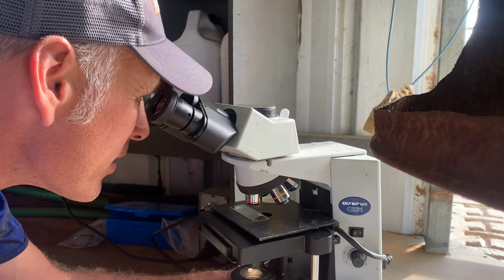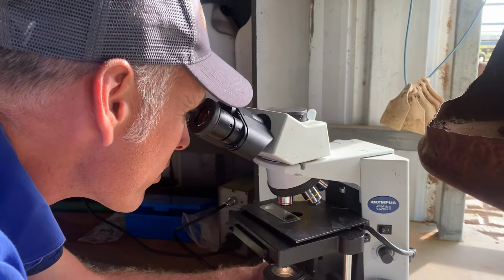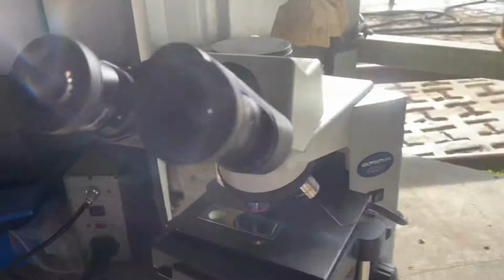Oh, cool. So he's like a 90%er, which is exceptionally good semen. Very good semen, good enough to make straws from if he was good enough to AI with. As you can see, 90% of those guys know where they're going. They're going, where's the egg? Where's the egg? I've got bad news for them.